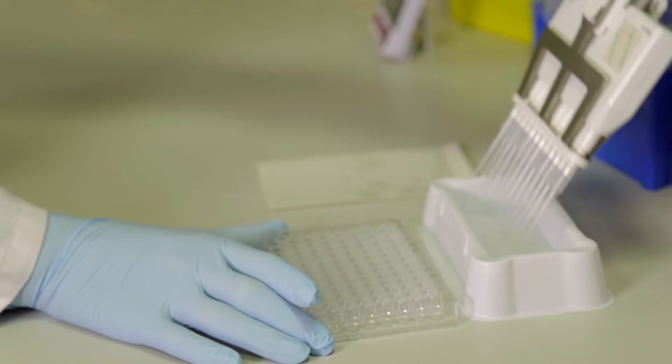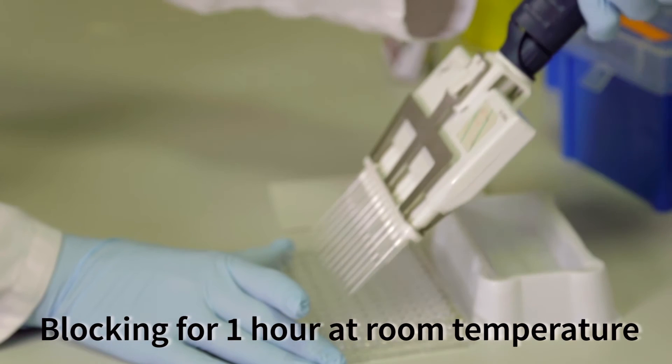In order to prevent non-specific binding of contaminant molecules to the plate surface, or incorrect binding to our capture antibody, we then treat each well of our 96-well plate with a blocking solution. Blocking solutions typically consist of mixtures of proteins or detergents, which bind any sticky spots upon the plate surface or the antibody itself. Blocking typically lasts for at least one hour at room temperature. Following the coating and blocking of this first antibody, we then wash the plate again in the same manner as previously.